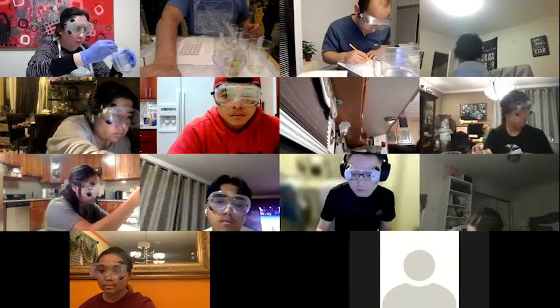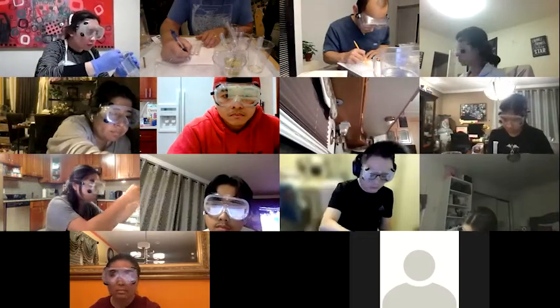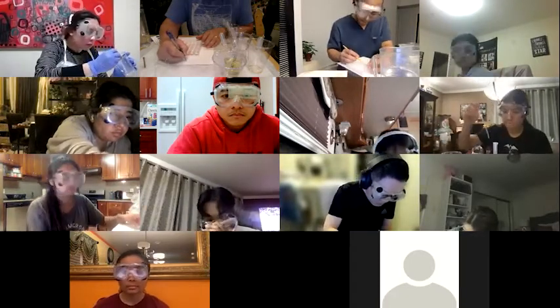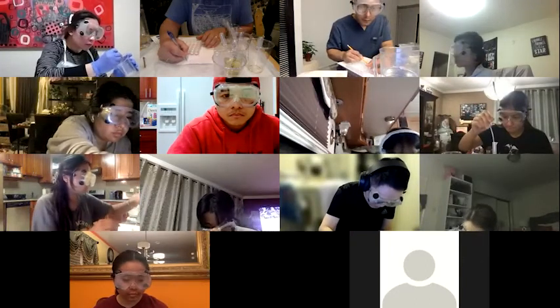So the first column, we don't add anything. Second column, I'm going to actually probably write this right on the paper, would be helpful. One drop of HCl. Third column, 1 drop NaOH.